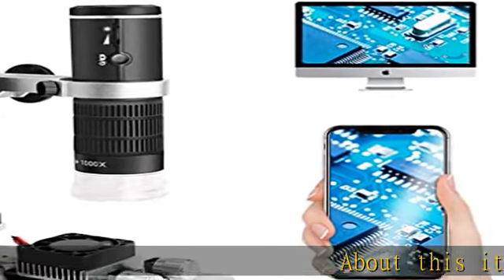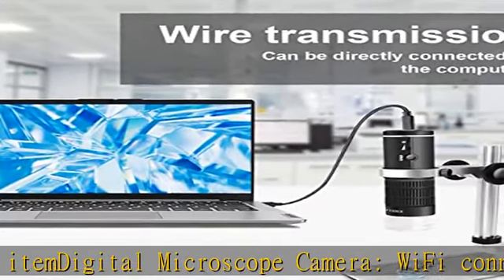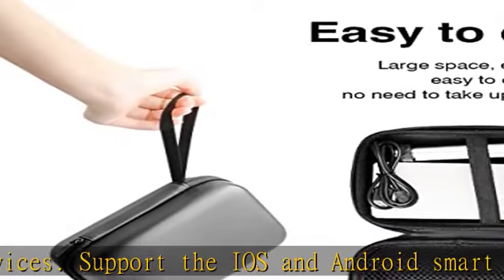Digital Microscope Camera. Wi-Fi connects to smart devices, supporting iOS and Android smartphones and tablets. USB cable connects with the PC. Compatible with Mac, Windows XP, 7, 8, 10, 11, and Linux systems.